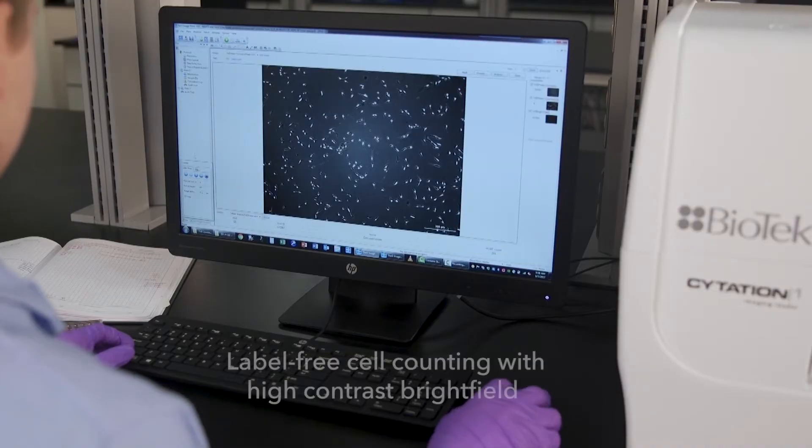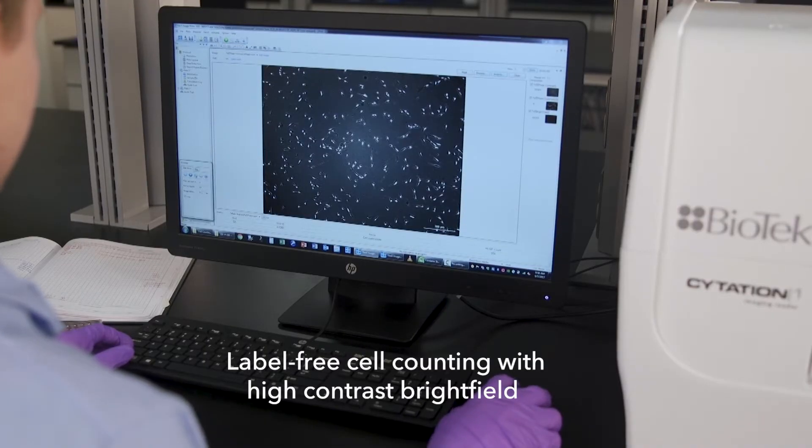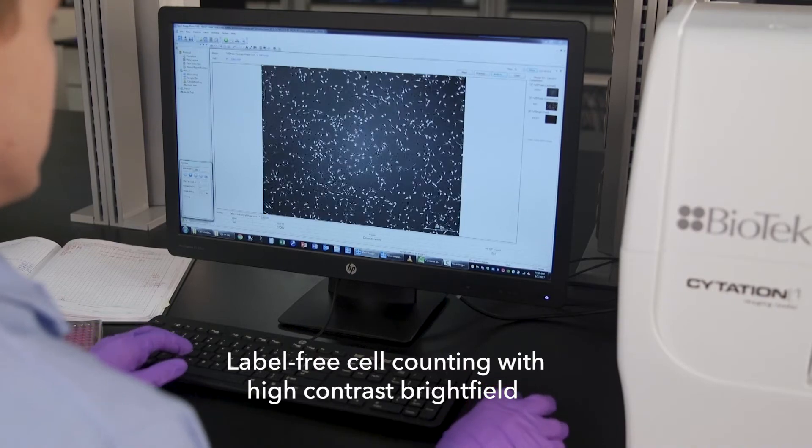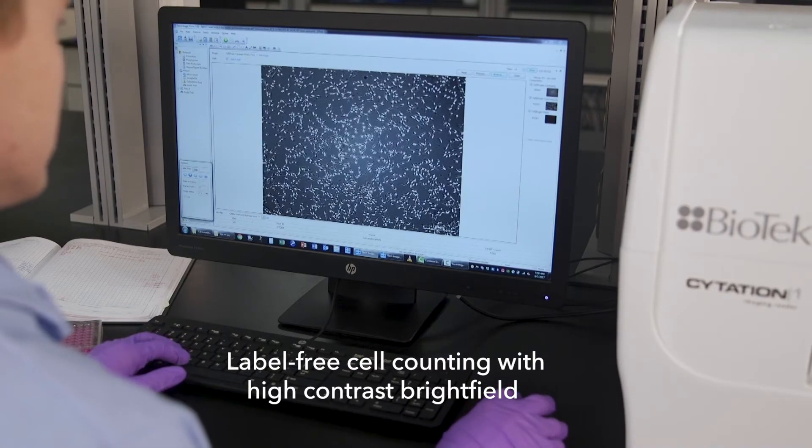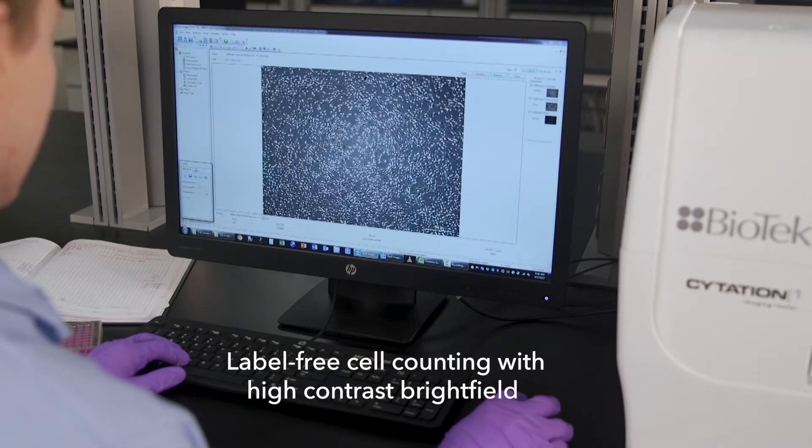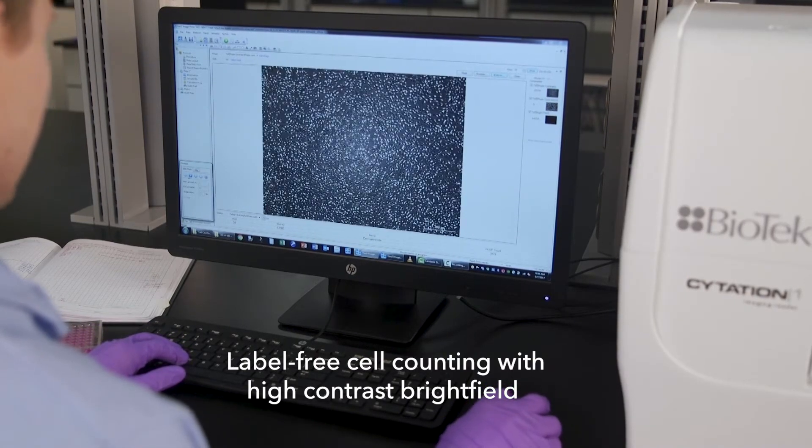Citation One enables label-free cell counting using unique high-contrast brightfield to maximize the contrast of cells over the background.